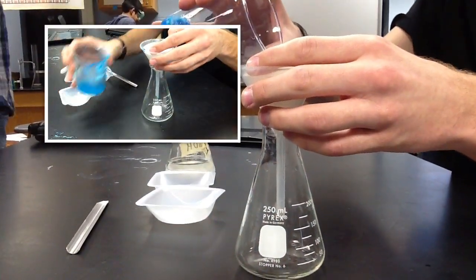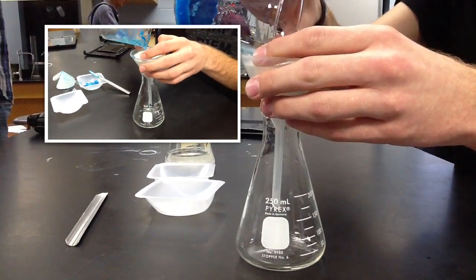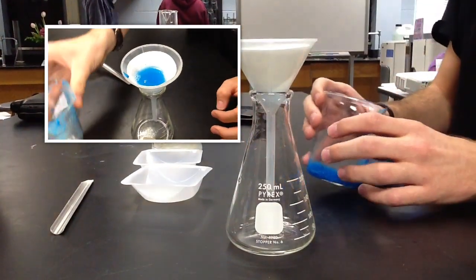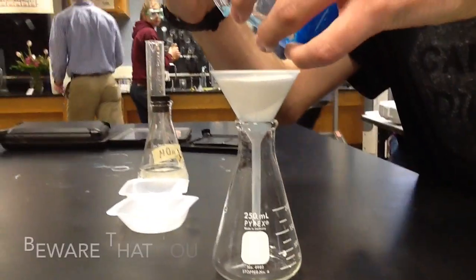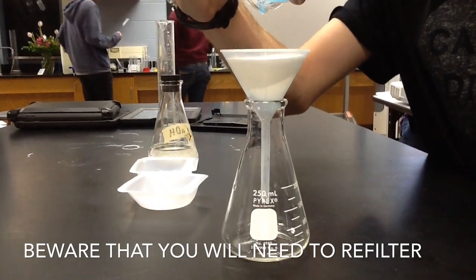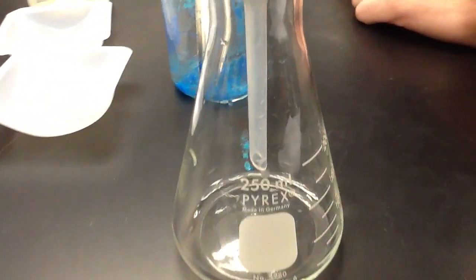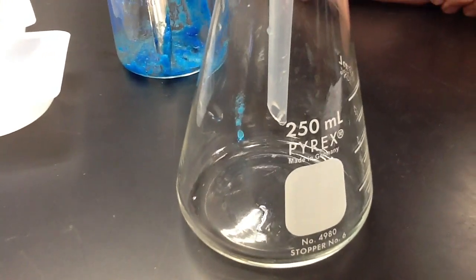Pour the product into the funnel so that the filter paper can separate the two products and collect the sodium sulfate into the flask. The product will be a clear substance that has formed at the bottom of the flask.